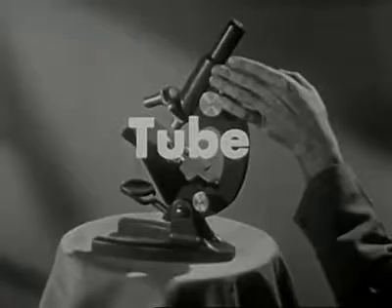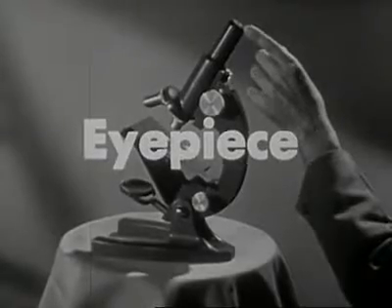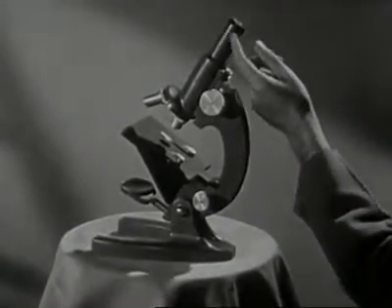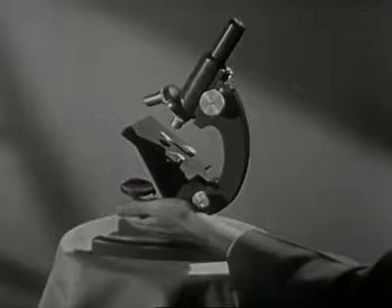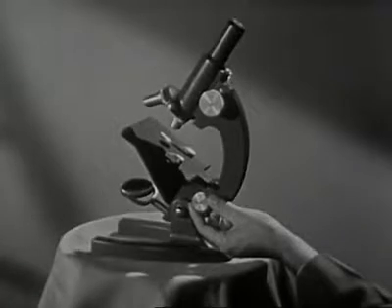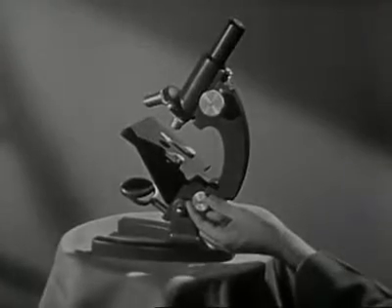The tube is part of the main body of the microscope, so named because of its tubular shape. The eyepiece is the lens located at the top of the tube, nearest the eye. The adjusting knob is used for focusing, and the mirror for reflecting light onto the specimen. An additional focusing knob is found on most modern microscopes. It is used for critical focusing, which we'll learn more about shortly.